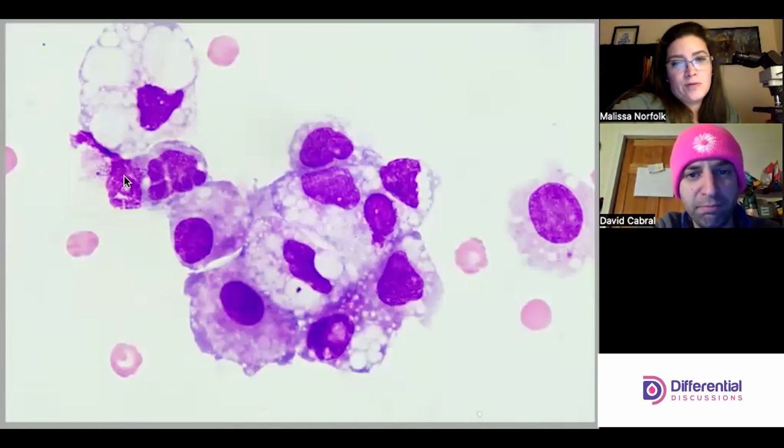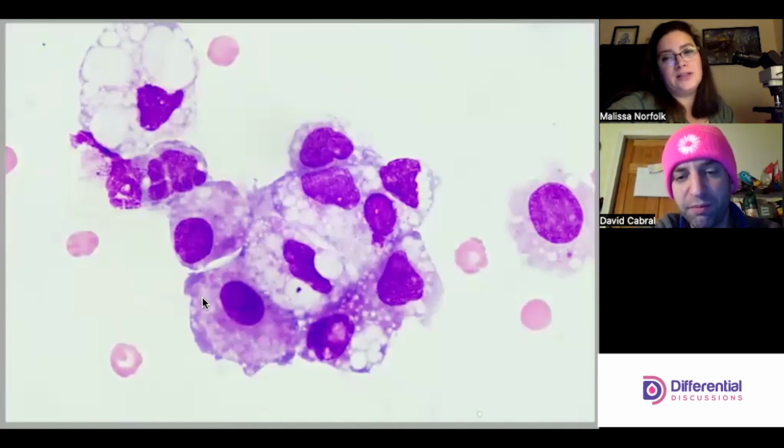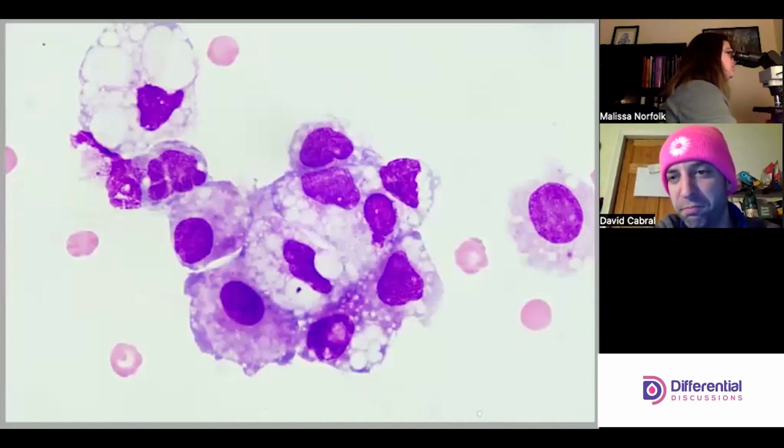I think these are more of the meso-y. This one and that other little one that we just looked at. I think these are more of the meso-ys. And then the rest of these just look like monomacs. Yeah, monomacs probably.